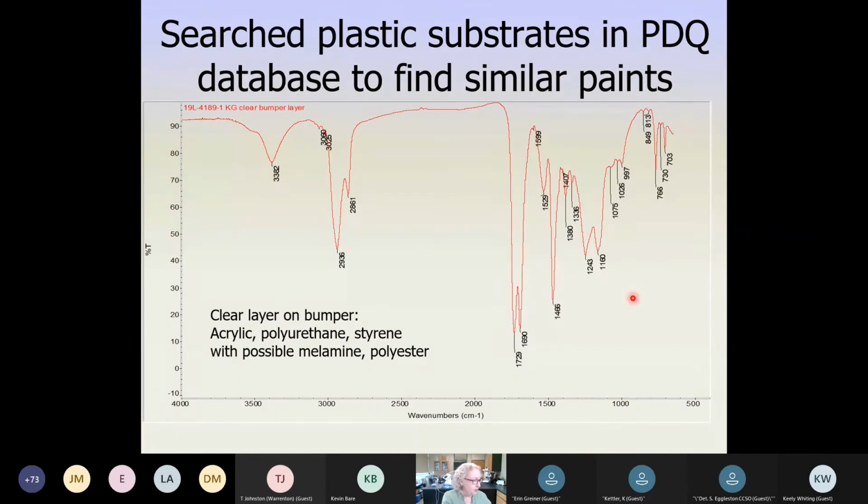So I took that clear coat, and as you remember, hopefully, from last week, I am doing FTIR analysis to give me a spectrum that lets me know about the ingredients that are in the clear coat. Now, normally this technique would tell me about the pigments and the binders, but this is a clear coat, so we don't have any pigments. So it is all binder by itself. But clear coats are very high tech, so they are commonly a mixture of a lot of different ingredients. They're also very proprietary in that different manufacturers are going to use their own version and not share that information with other manufacturers. So there is a lot of difference potentially between the clear coats of, say, my Toyota Camry and someone else's, Ford Mustang or whatever.